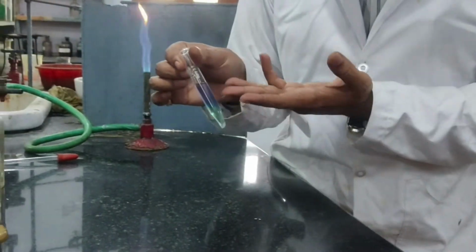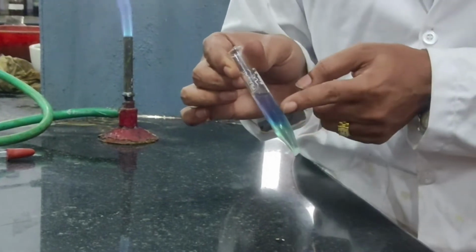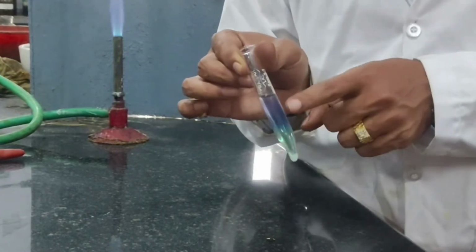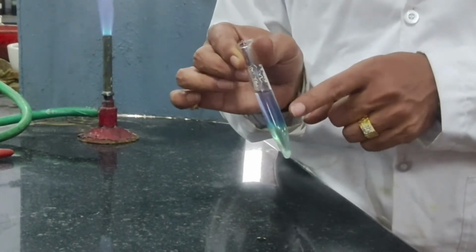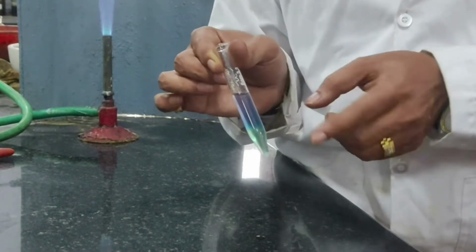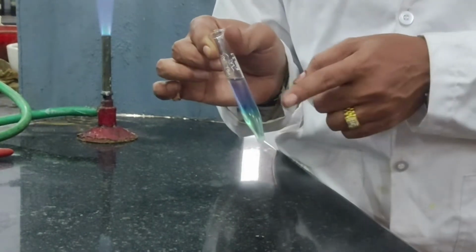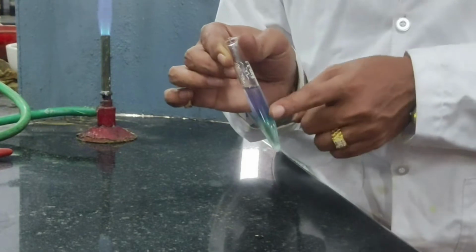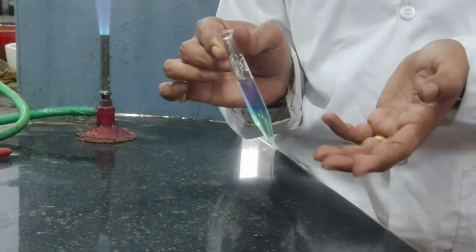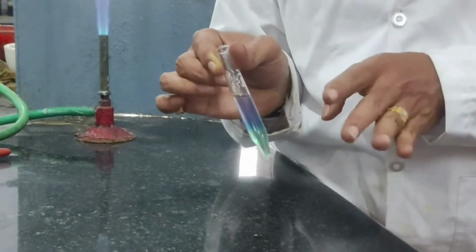Did I get a precipitate? I did not get any precipitate. Of course, you might be observing a small change in color here, but I did not get any precipitate, which implies I do not contain third group cations in this. Because what is third group reagent? Ammonium chloride solid and ammonia is the third group reagent. If I add third group reagent and get a precipitate, it implies third group cations are present. But I have added third group reagent here, I did not get any precipitate, implies third group cations are absent. Of course, obviously third group cations will be absent because this is a solution supplied to me by the lab attendant for fourth group analysis.